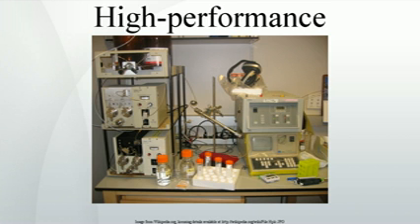These ultra-high-performance liquid chromatography systems, or UHPLCs, can work at up to 15,000 pounds-force per inch squared, or about 1,000 atmospheres. The term UPLC is a trademark of the Waters Corporation, but is sometimes used to refer to the more general technique.